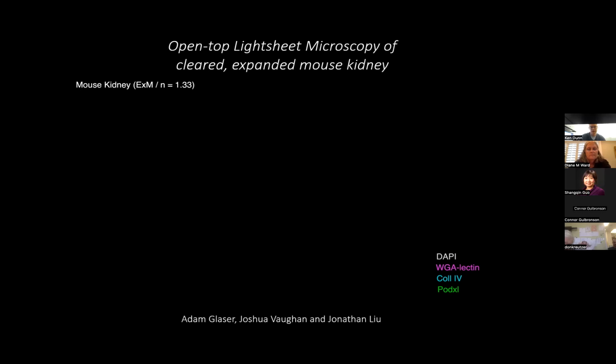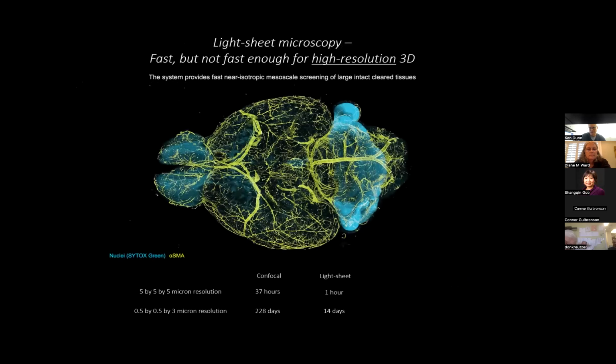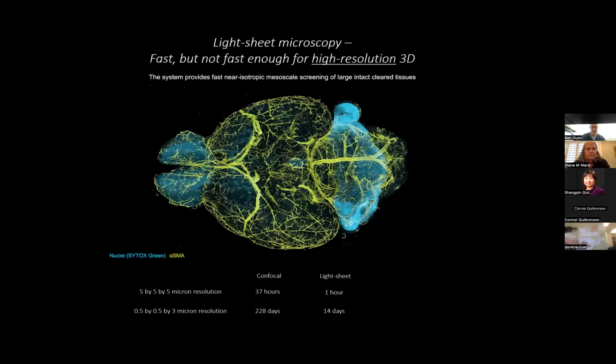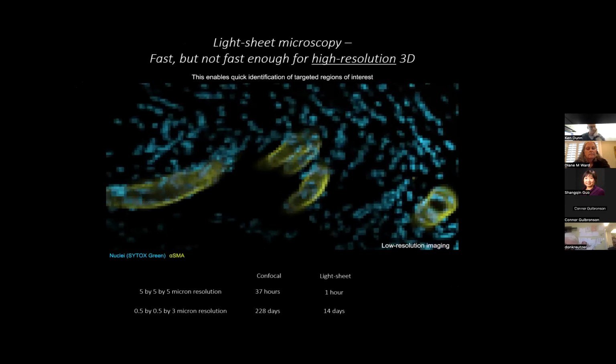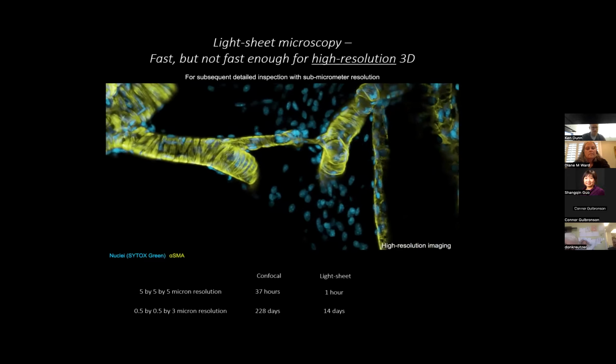So we have a system on campus. It's strictly for VA. I'm not aware of anybody in the CCEH who has one of these things, but I could easily be wrong. To be honest, a lot of these things are languishing because people buy the system and they don't end up getting used because they're not that trivial to use. So if people are interested in this, I suggest that they explore their institution.